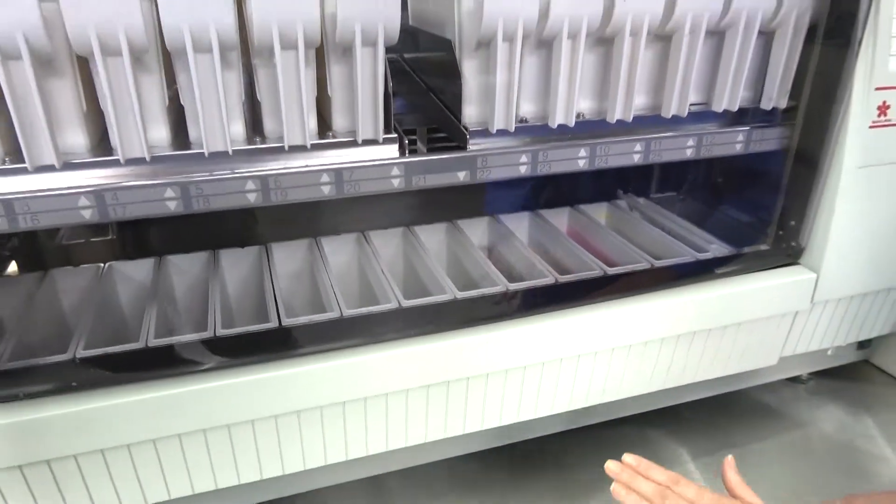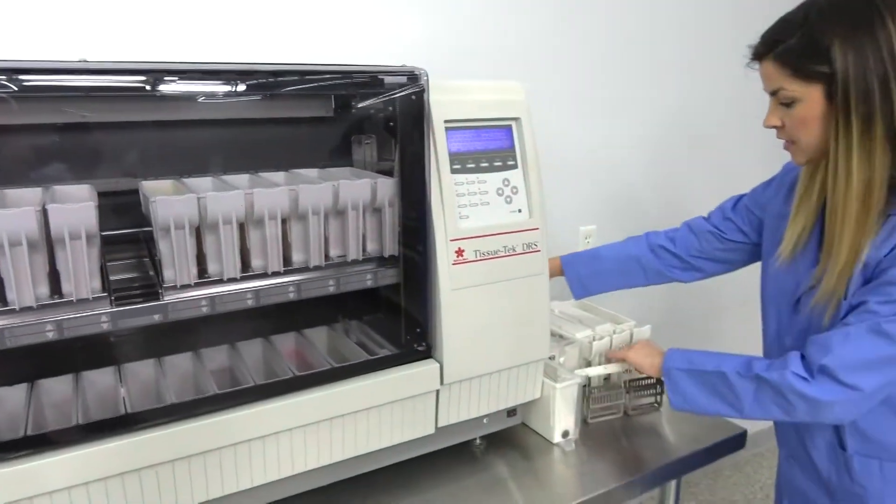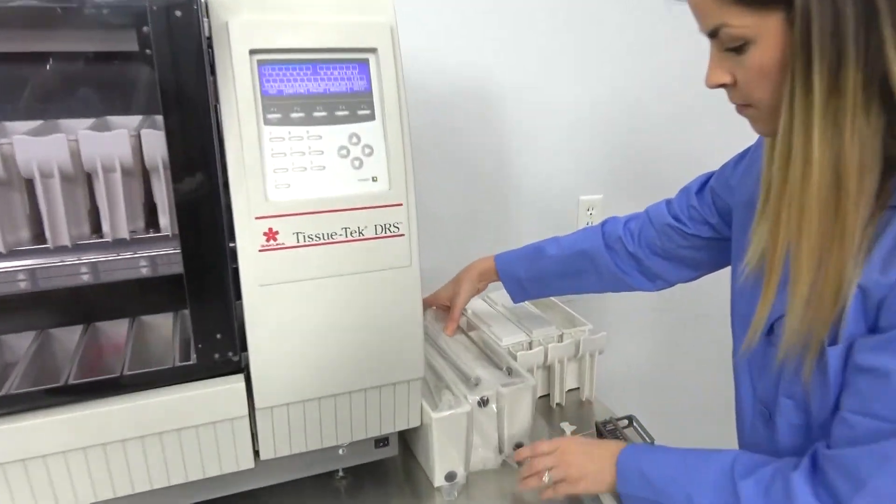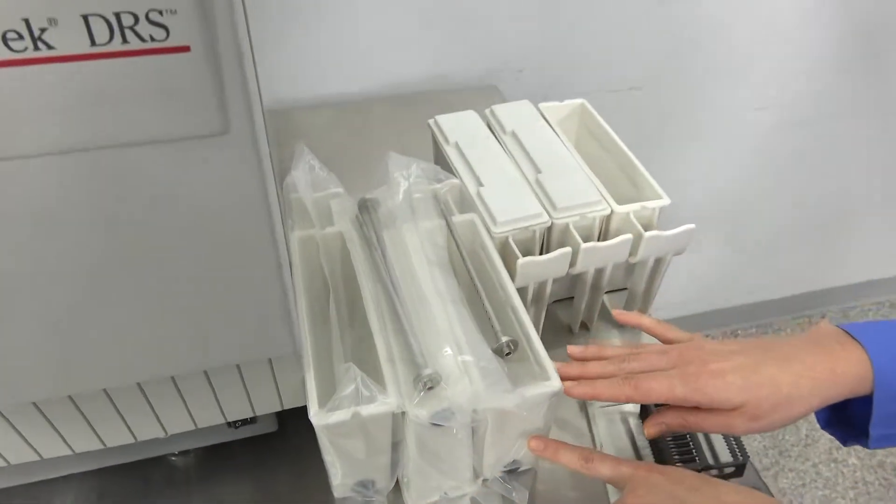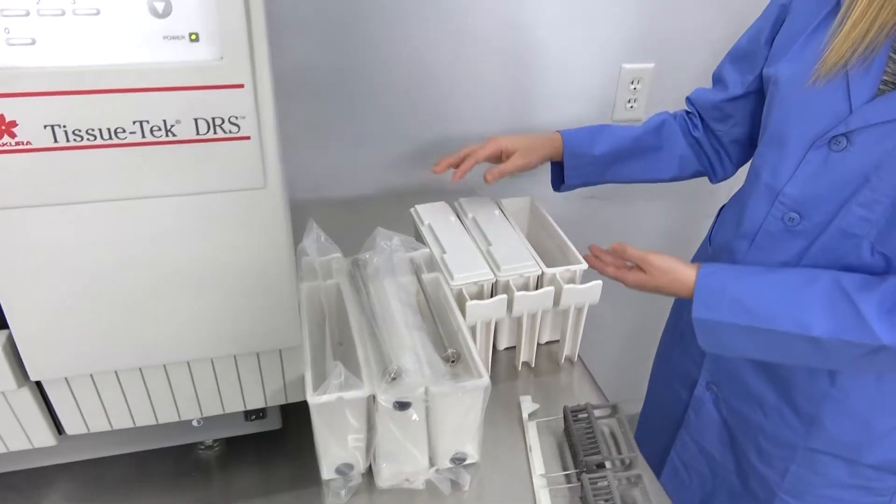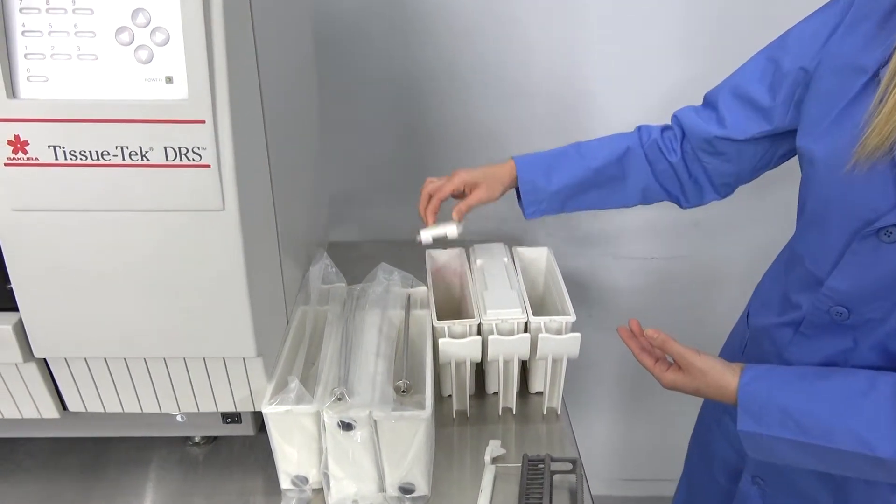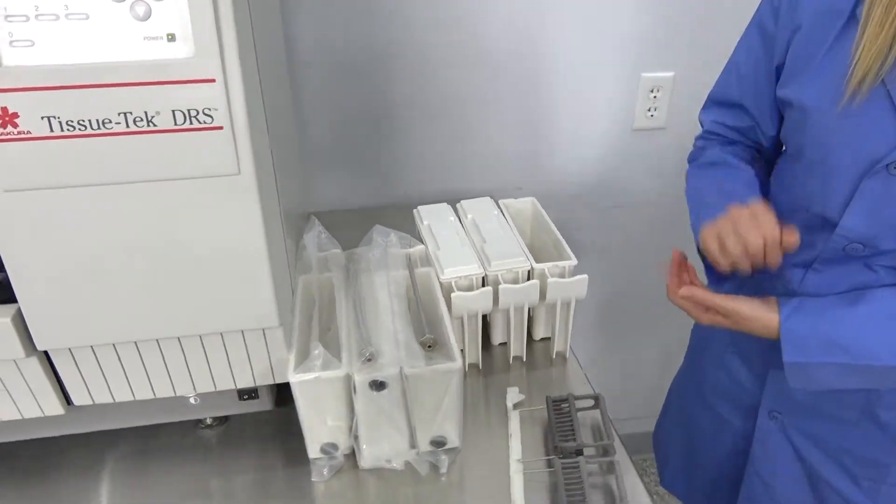And you can actually have up to five wash stations at once. This comes with an additional three buckets to transition into your wash buckets. And then it will come with three additional reagent buckets as well. And all of the lids are included here. Here are two to show you the lids.